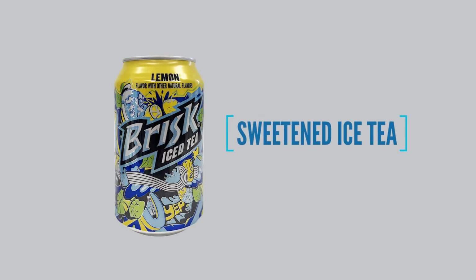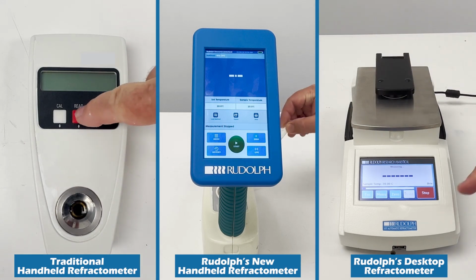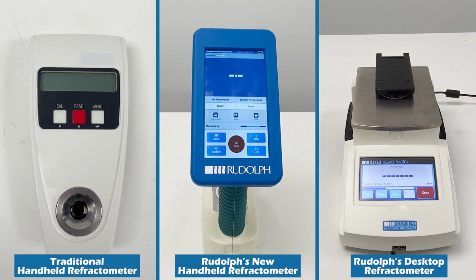The first sample we will test and compare is sweetened iced tea. Measuring materials like iced tea are a very typical use of a handheld refractometer. Chemically, they are mostly sugar and water, with a small amount of other material to give taste. Measuring sugar solutions to around 0.1 Brix is one of the most common applications for a handheld refractometer. For this application, all 3 instruments perform exactly how they should.